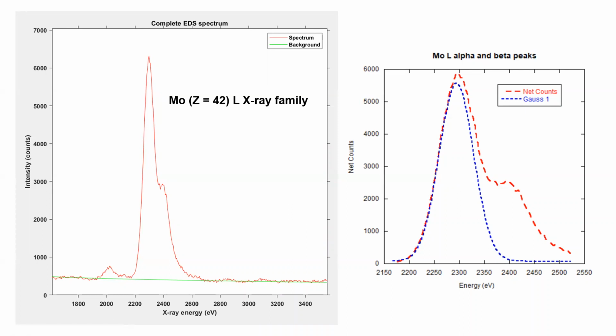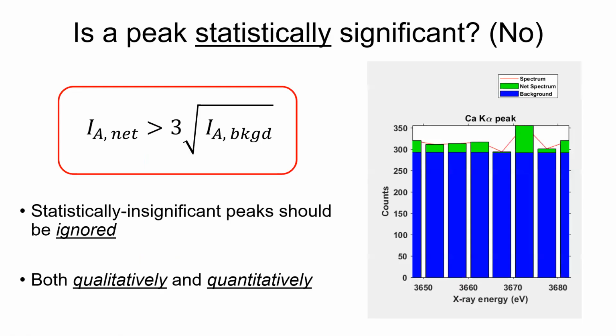So we have a little more work to do if there are peak overlaps, but it can still be done fairly easily if you have the ability to model it. I did this with Kaleidograph. MATLAB does have the ability to do Gaussian peak fitting, but I don't have that feature in my version of it, so I had to use Kaleidograph, which does it pretty well actually.